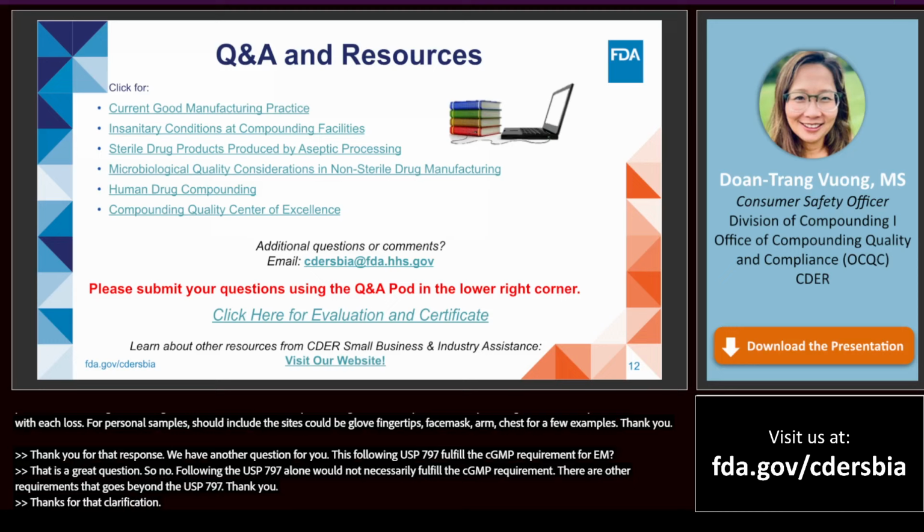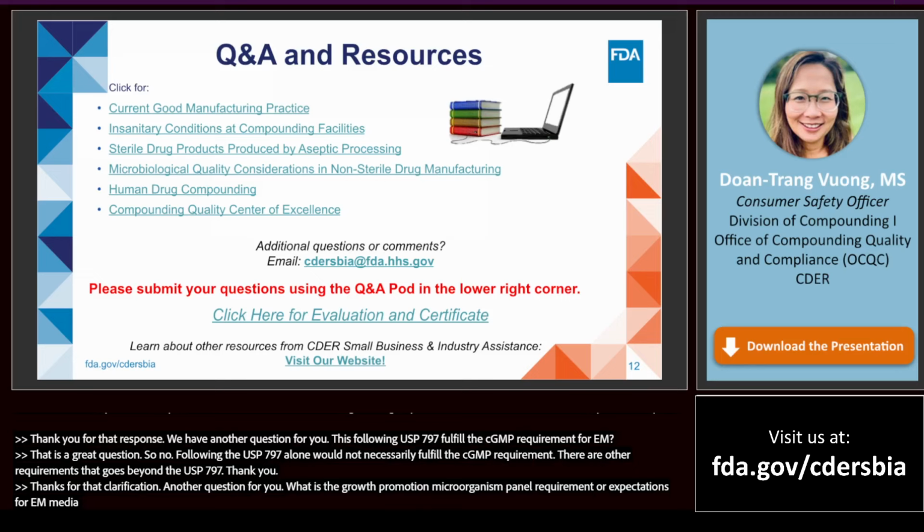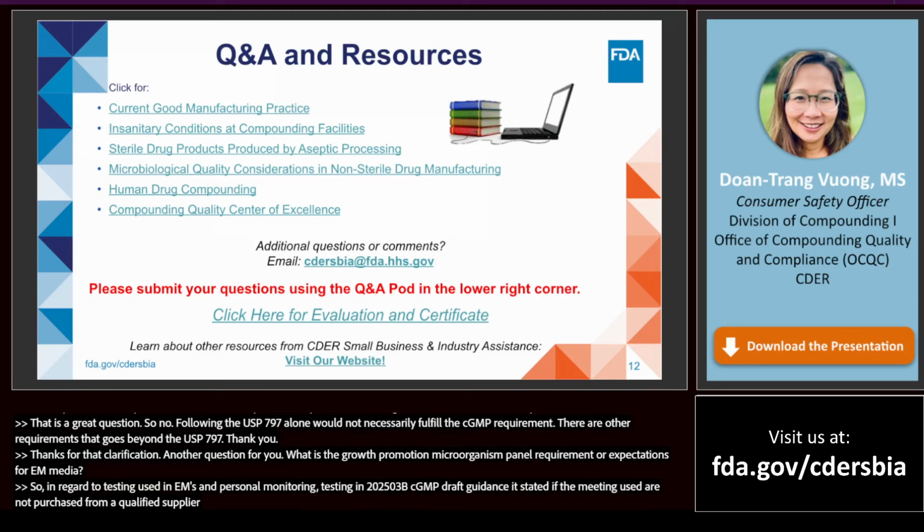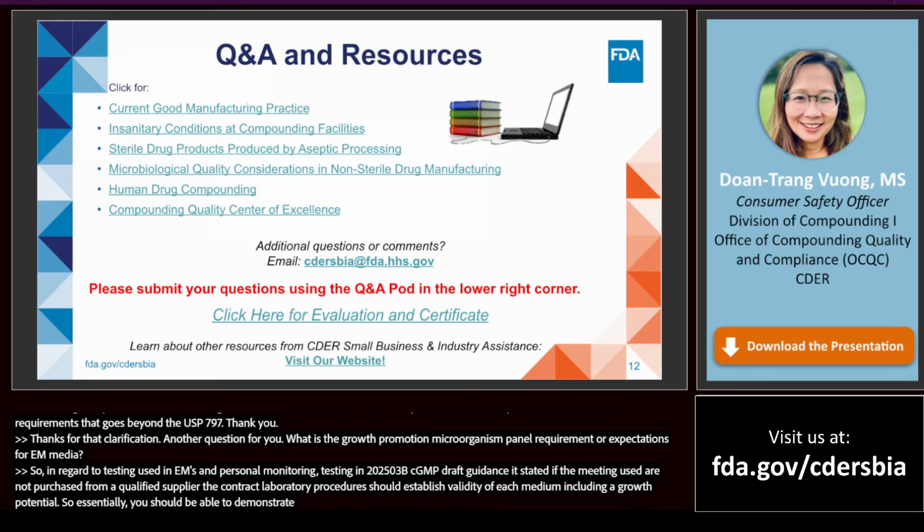Another question for you. What are the growth promotion microorganism panel requirements or expectations for EM media? In regard to growth promotion testing of media used in EM and personnel monitoring, our 2020 503B CGMP draft guidance stated that if the media used are not purchased from a qualified supplier, the outsourcing facility or contract laboratory should establish the validity of each medium, including its growth potential. Essentially, you should be able to demonstrate that your in-house media can reliably recover microorganisms.